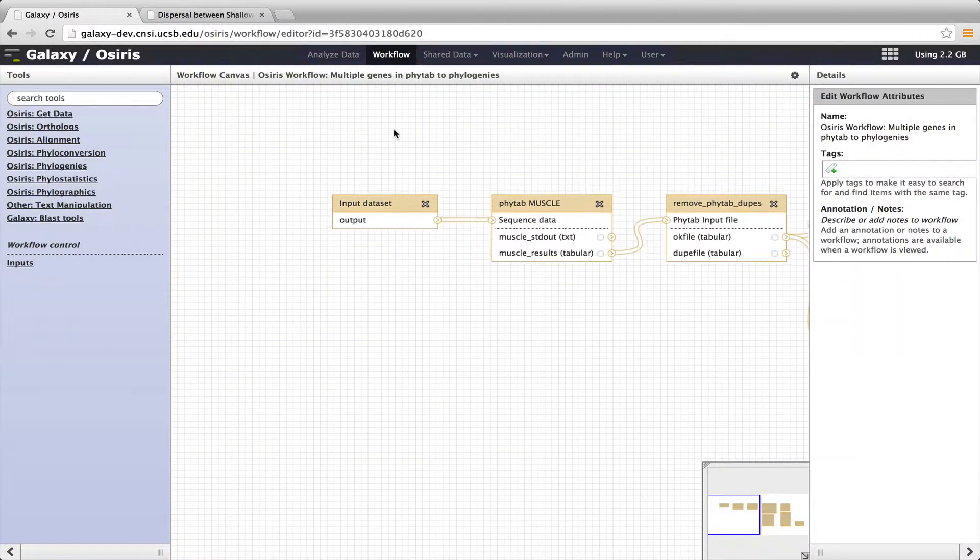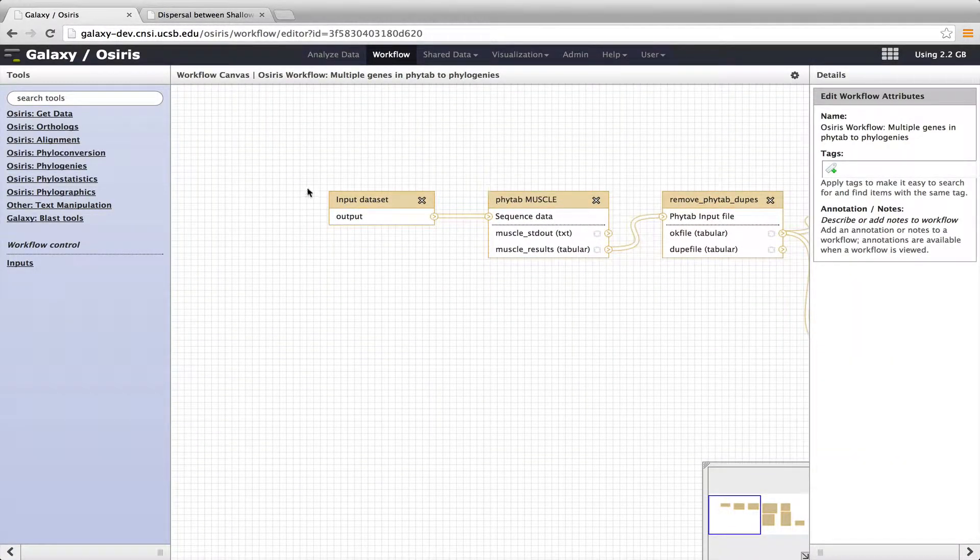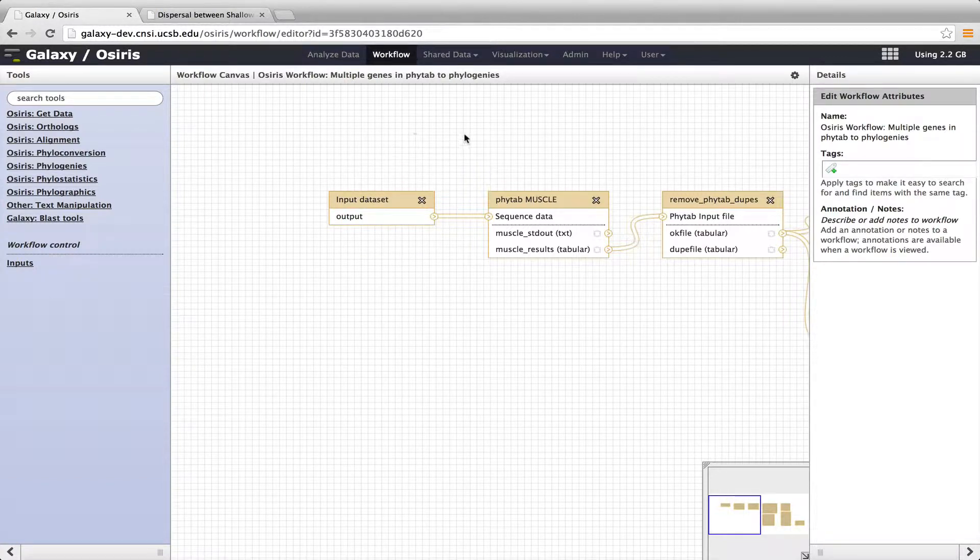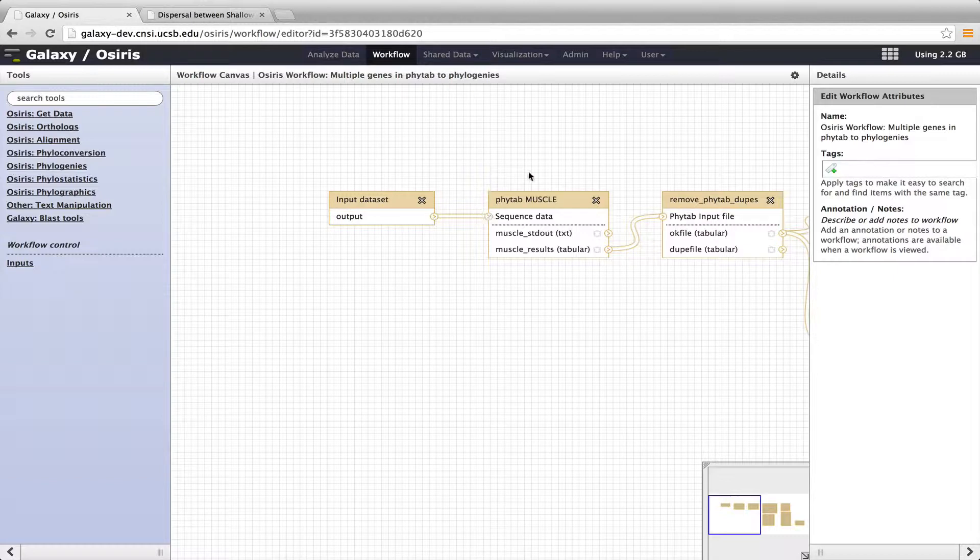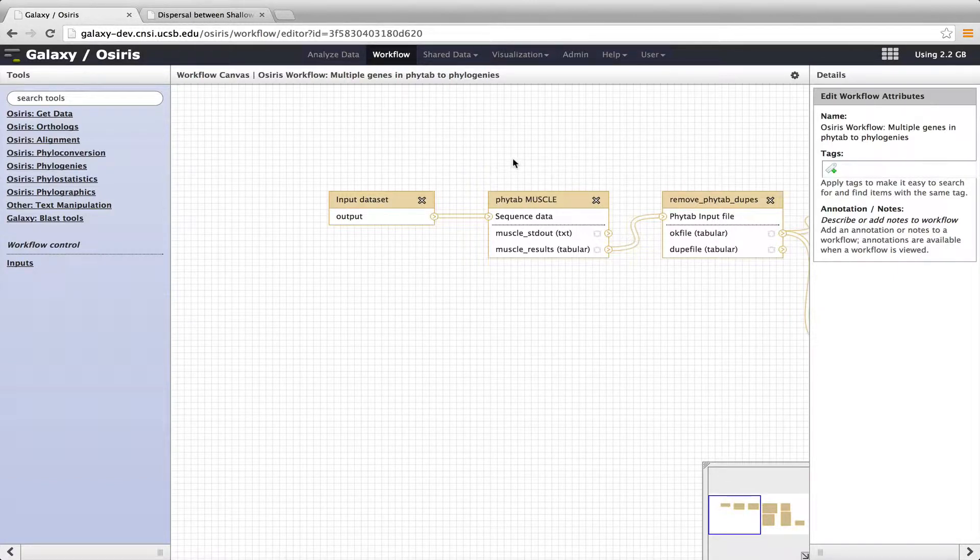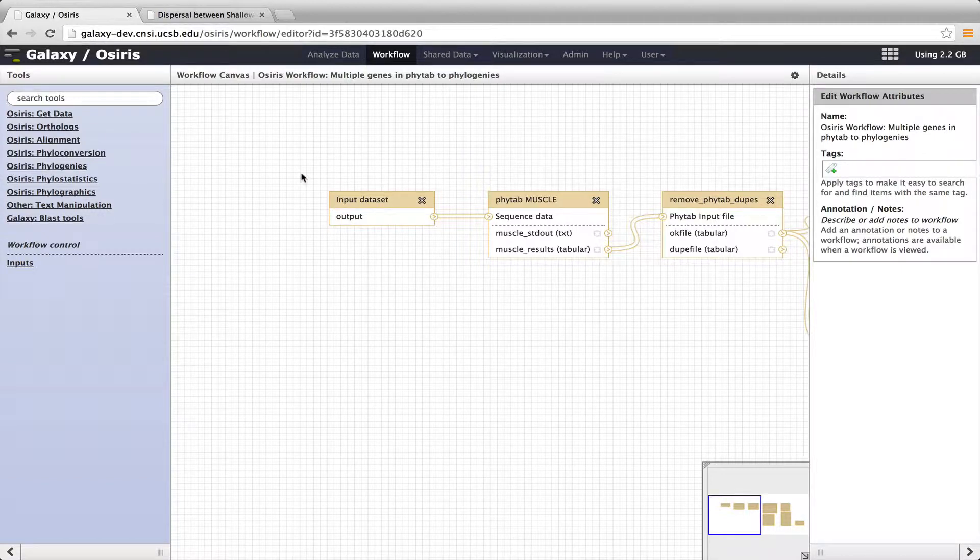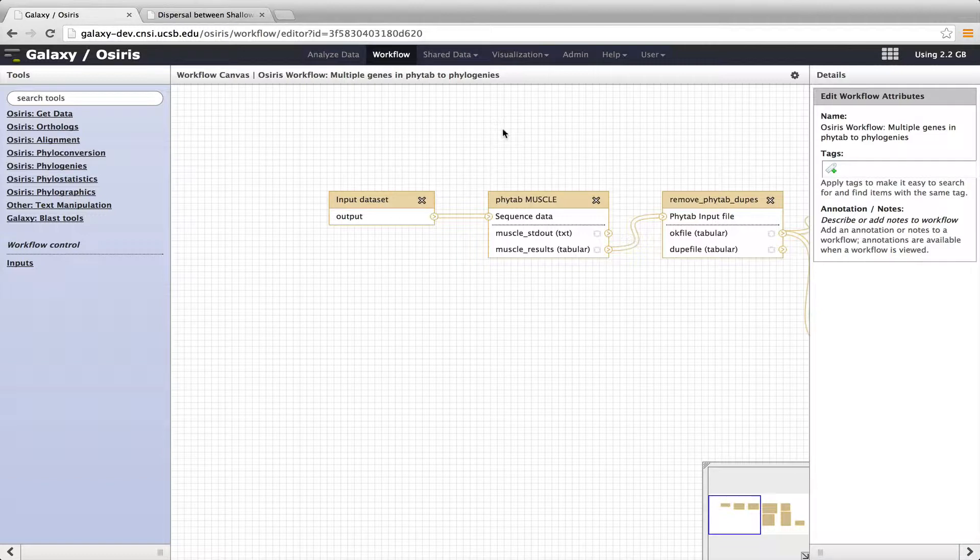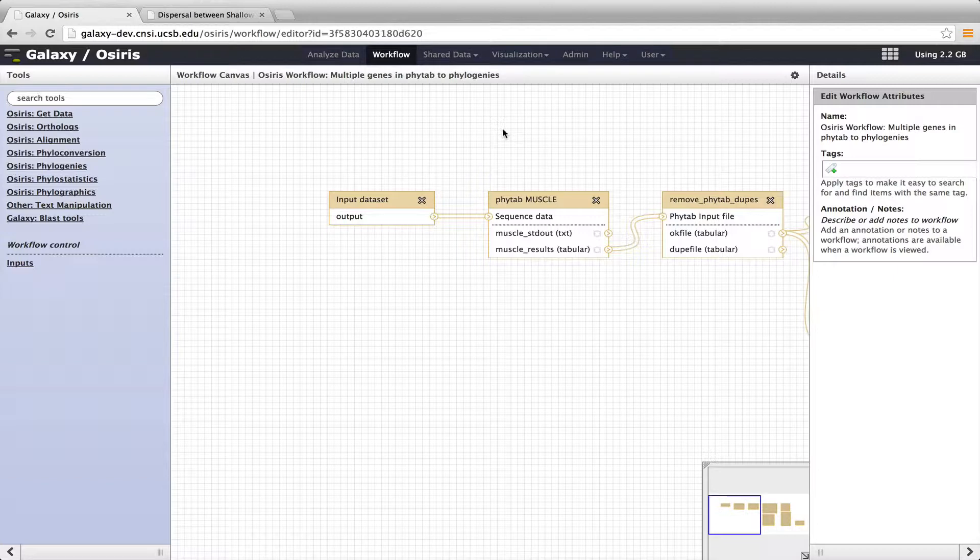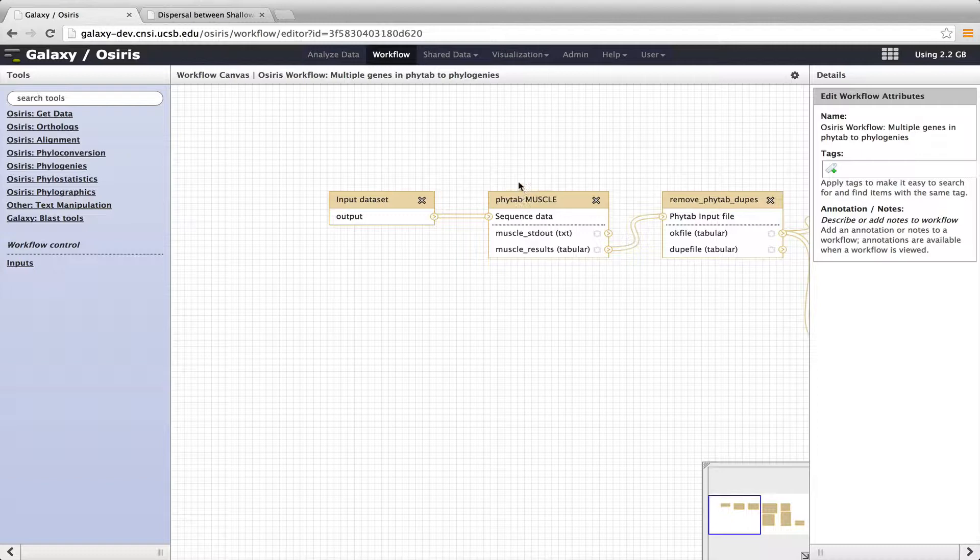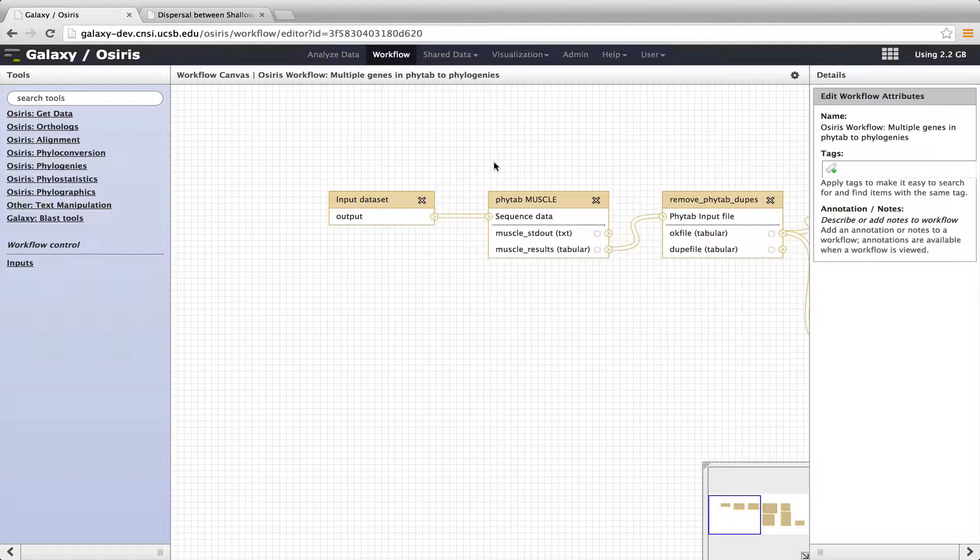So what this tool does is it allows us to input a data set. That's the PHYTAB data set that I just showed you. This passes that data into a tool called PHYTAB Muscle. So Muscle is a sequence alignment tool, and the nice thing about this is that even though we have four genes in this data set, PHYTAB Muscle will parse those genes out and align them separately. So each gene will be aligned separately. So usually tools like Muscle only take one gene family at a time, but we've written multiple different PHYTAB tools to parse or to use multiple genes or gene families all at the same time.